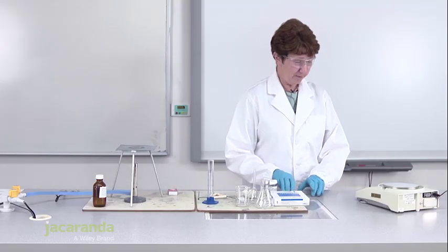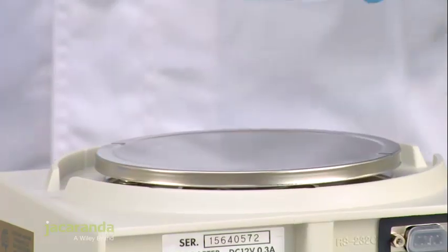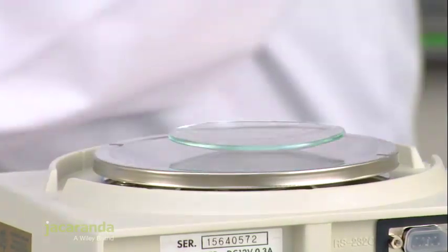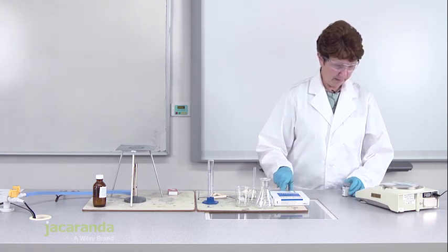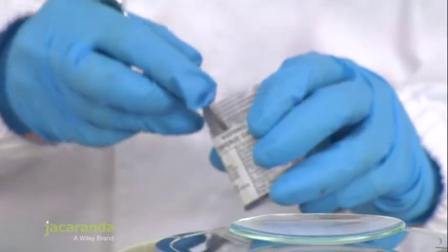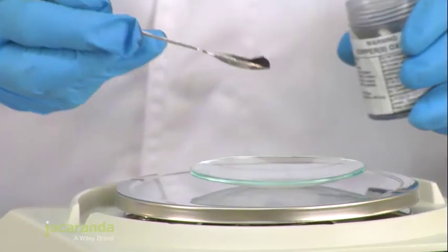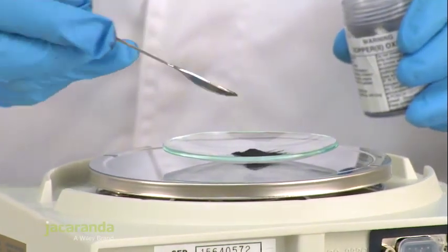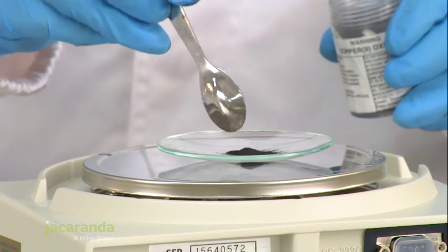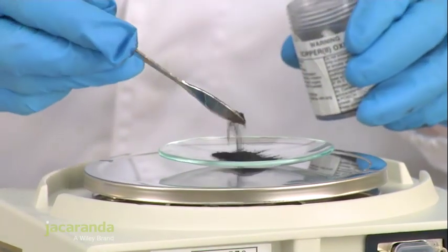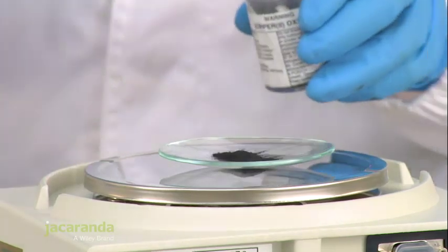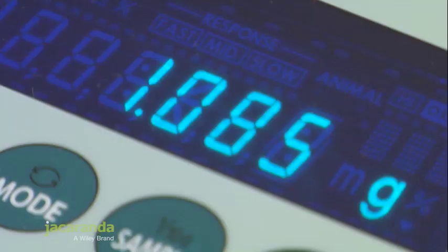First thing we're going to do is weigh out some copper oxide. We need one gram of copper oxide. So we need to use our spatula to remove the copper oxide. I'm just adding a small amount to start with. We now have a mass of 1.085 grams of copper oxide.